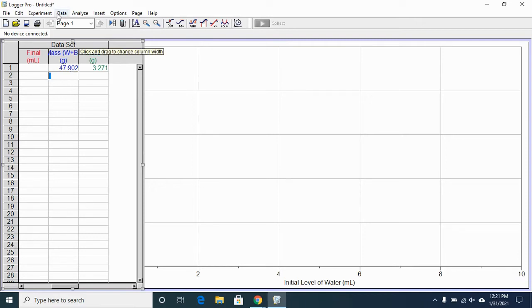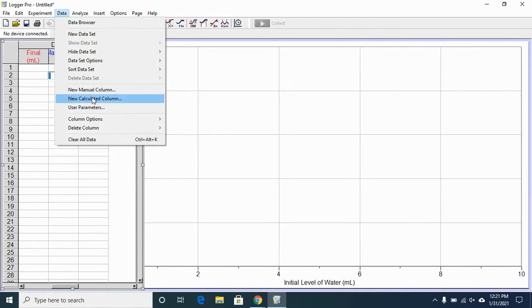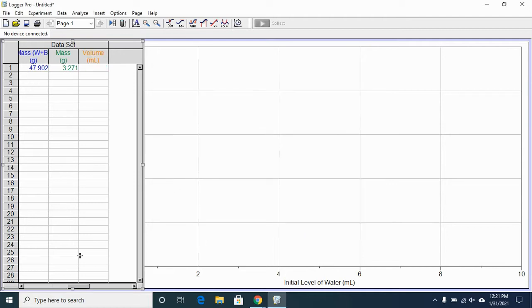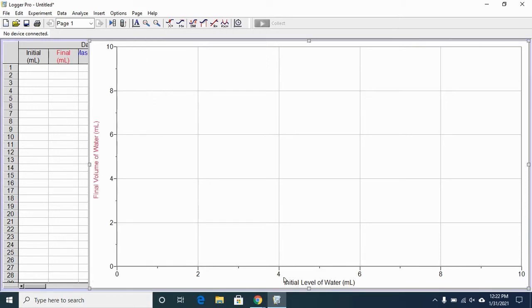I'm going to do my other calculated column. And the expression for this is that it's going to be the final volume that was on the burette minus the initial volume. And those are two columns. Now I'm going to fill out my data. And you'll see that the calculated columns will calculate automatically. Then we'll worry about formatting the graph. Right now it's going to graph initial level of water to final volume of water. And so it's going to be a nonsensical graph. But we'll format it later to graph the things that we want it to.